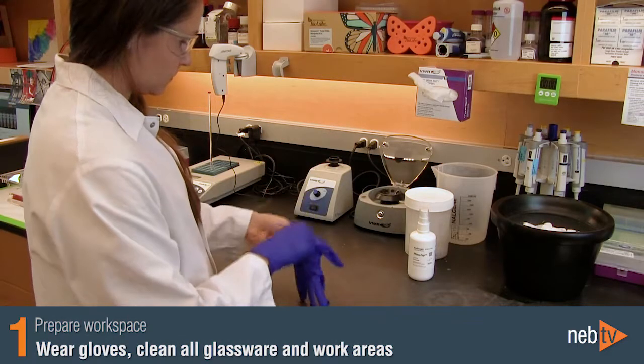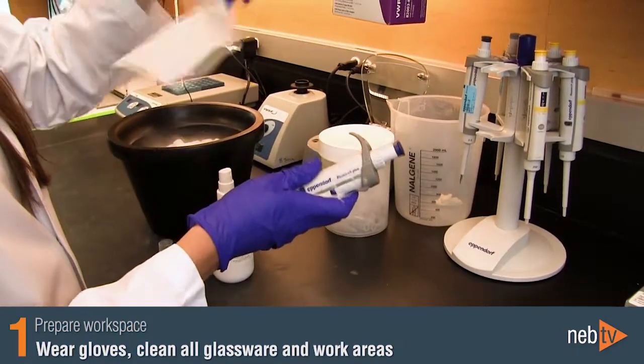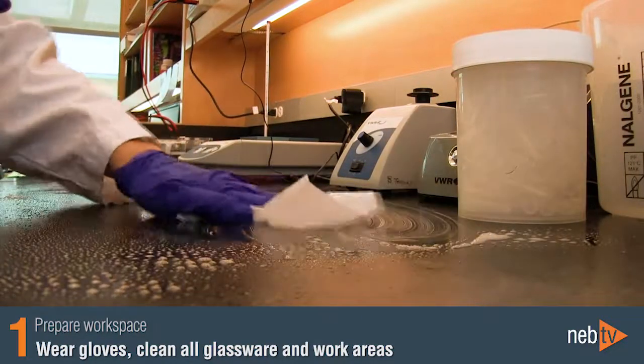It is important to work in an environment free from RNases. Always wear gloves, use RNase-free glass and plasticware, and clean your work areas. We recommend wiping bench tops with a cleaning agent such as RNase ZAP.